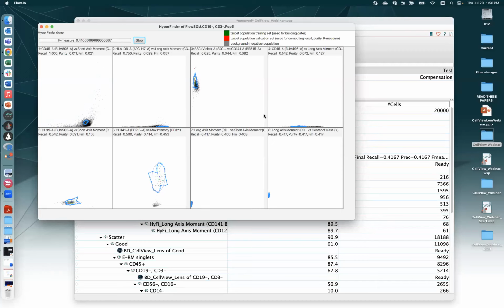And then if you have an experiment that even is in very few colors, but perhaps relies on something where, maybe not morphology, but the spatial resolution is super important. Like, are these two cells together expressing, maybe one parameter each that tells me what kind of cell it is, and are they in close proximity, maybe indicating that they are doing some kind of cell-to-cell interaction. That's the type of experiment where this tool will be really useful. I think it's definitely experiment-based, probably not useful for every experiment. And you probably wouldn't want to just run mundane experiments on the S8, would be my assumption, unless having really clean, pure results was very, very important for the target of the experiment.